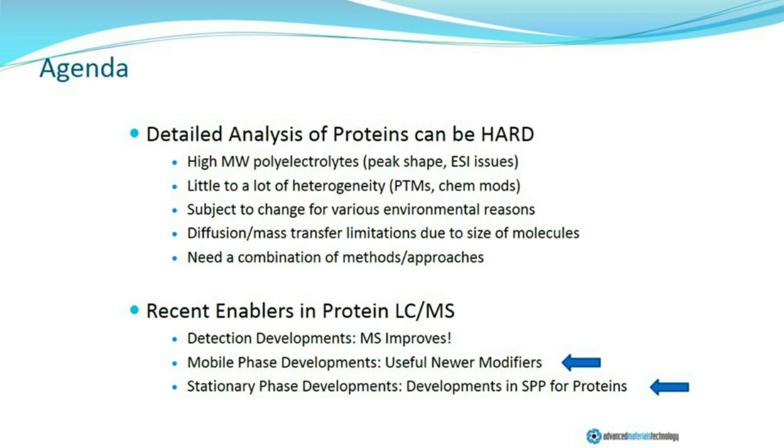The complexity is really a reflection of the complexity of the molecules that we're talking about. With protein mixtures or fragments of mixtures, we're dealing with relatively high molecular weight analytes that have a variety of charges. That is to say, they are polyelectrolytes.